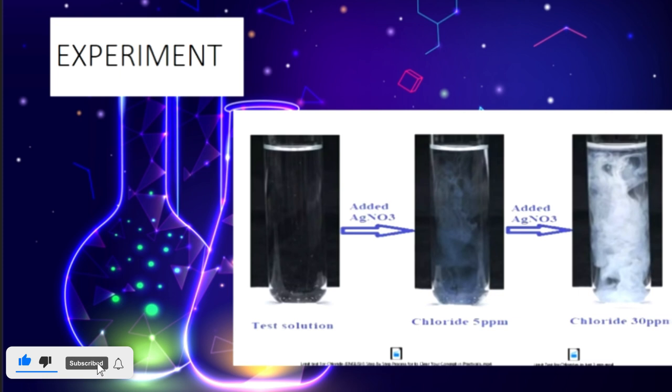We should add 10 ml of nitric acid and make up the volume to 50 ml with distilled water, and then you should add silver nitrate solution and stir immediately. Then we should compare the opalescence with the standard solution. This is the procedure we should follow.